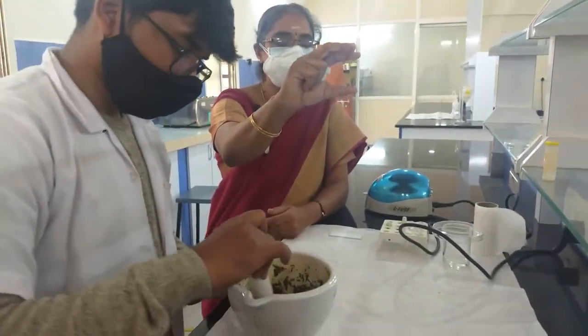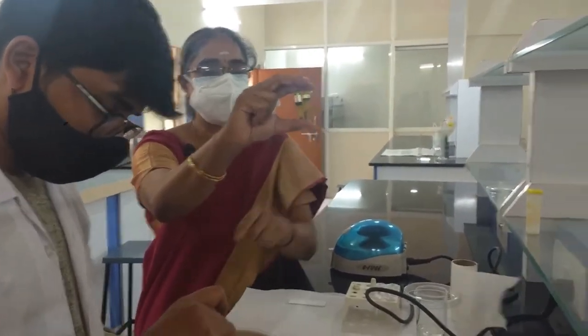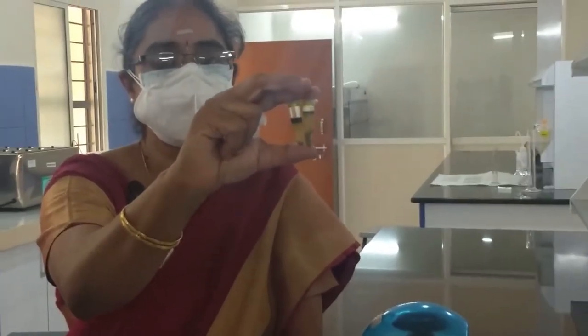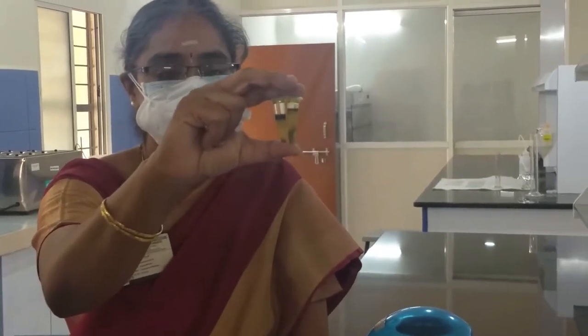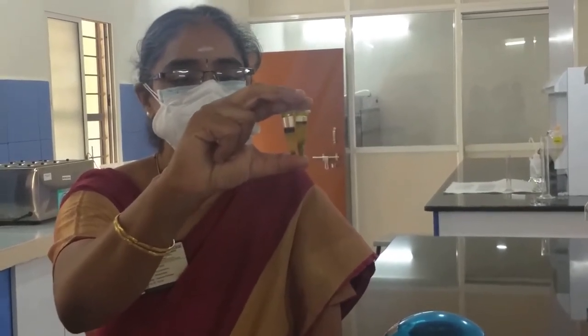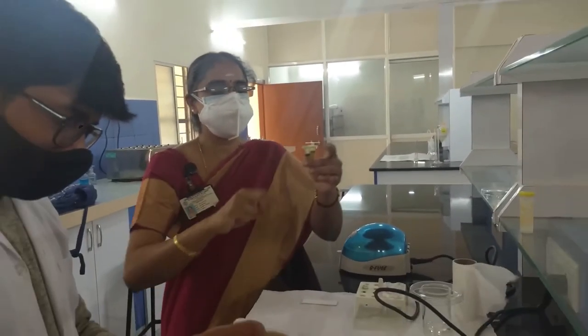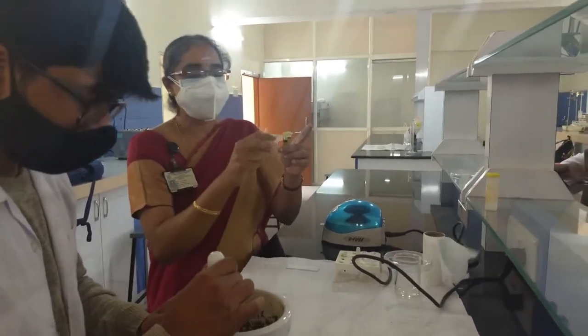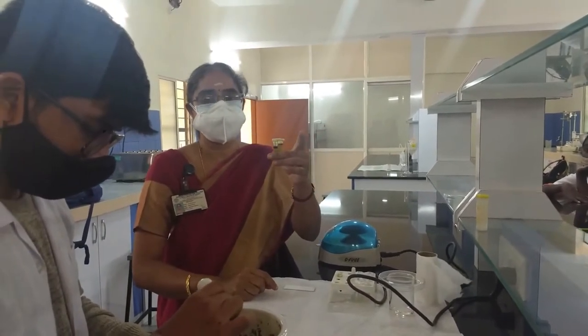You can see different layers in the extract. On top is the dark green color, which is the plant pigments now in the organic solvent layer. Below is the aqueous layer, which is water with few components and debris from the plant leaves and carrots. Transfer the contents into eppendorf tubes and perform centrifugation so that the layers get correctly separated, with the organic layer on top containing the sample.